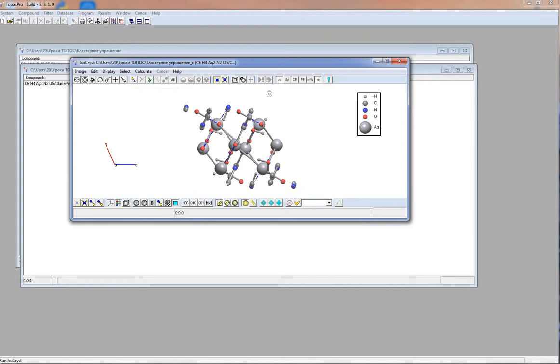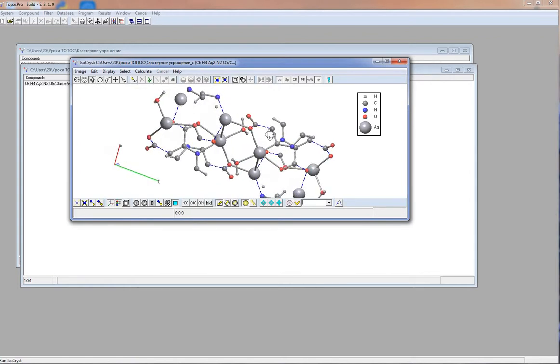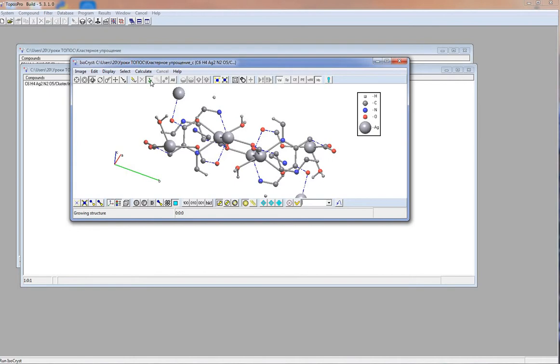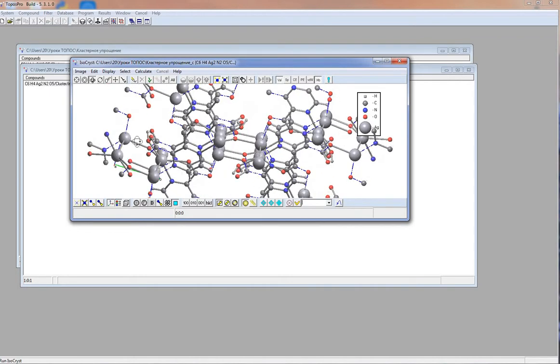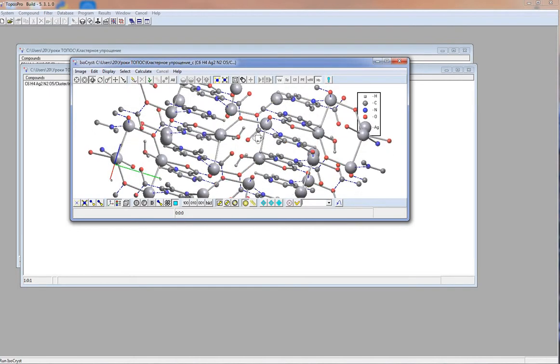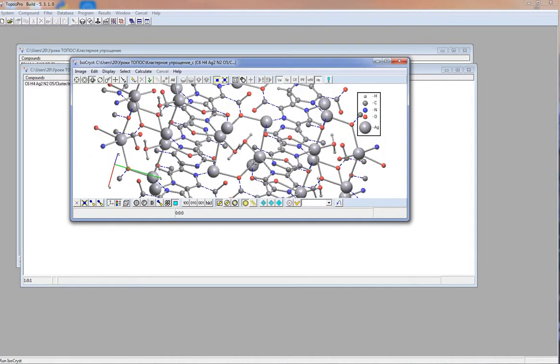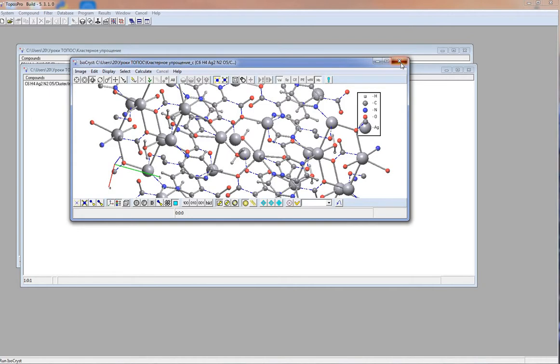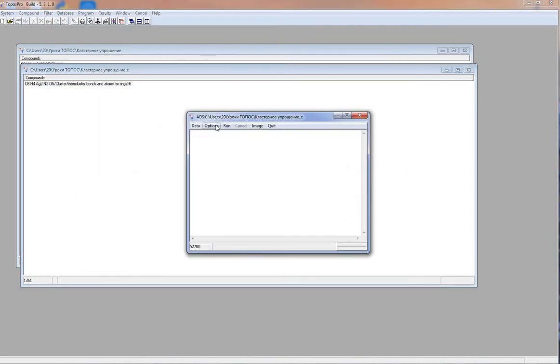Now, we should perform standard simplification for molecular packing connected by hydrogen bonds. If you don't know how to do it in details, see our lesson devoted to standard simplification. So I run ADS, options, save simplified net, standard method.